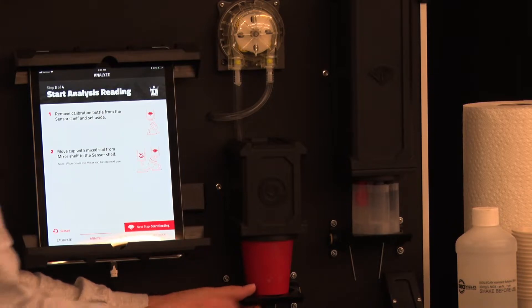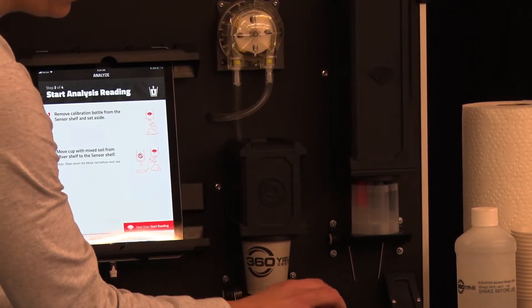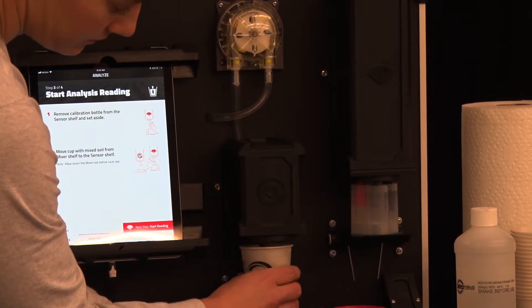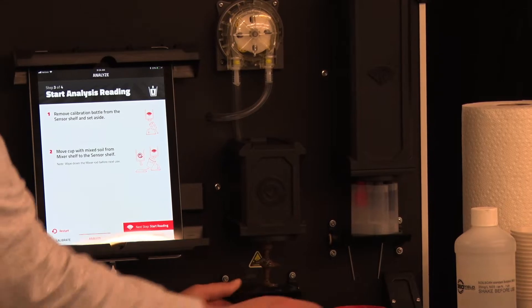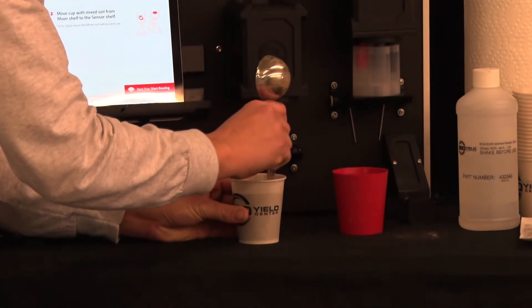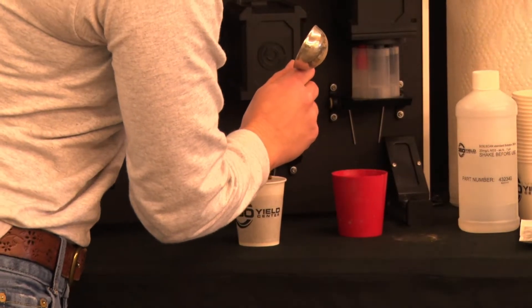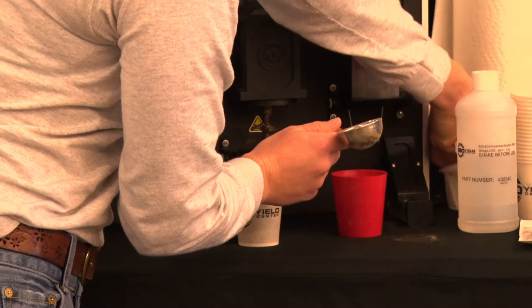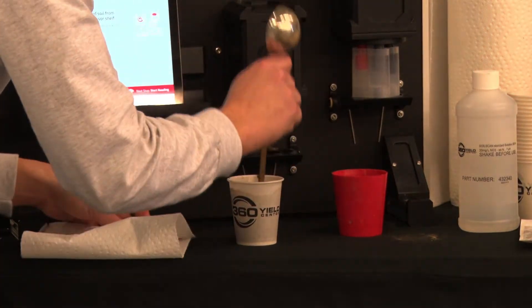What you need to do is remove the mixing cup and ensure that all of the soil has been mixed well together. I use the handle of the soil scoop. This will ensure that you get an accurate reading.